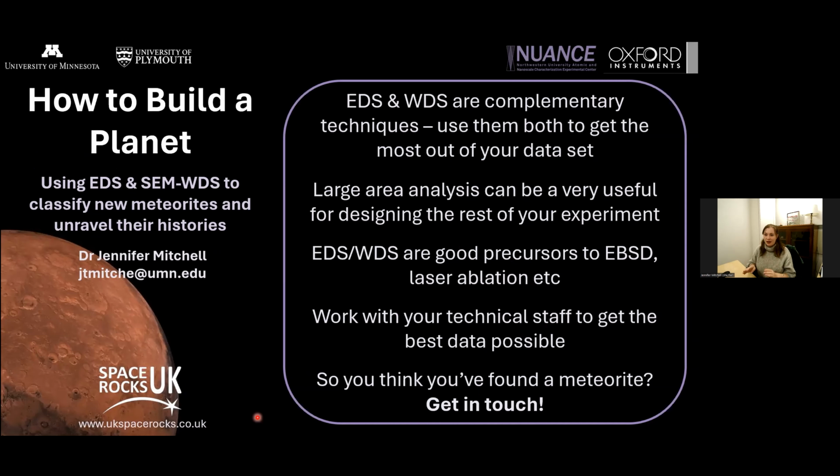Large area analysis, really good and a really key part of EDS. It's going to be really useful to help design the rest of your experiments. If you're just doing individual points, it can be quite easy to miss something, or there'll be a feature that you just don't look at. Finding those areas of interest that you can then target with other techniques or to retarget can be really beneficial.